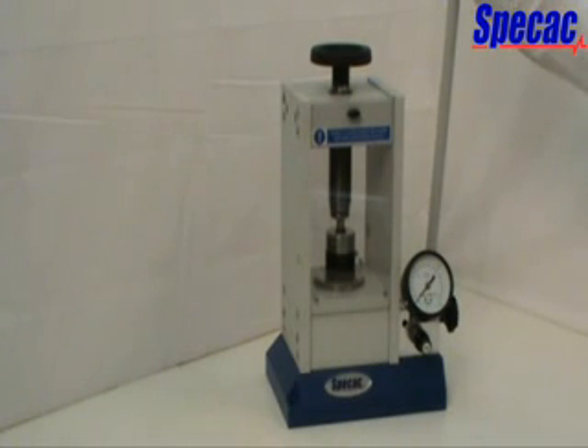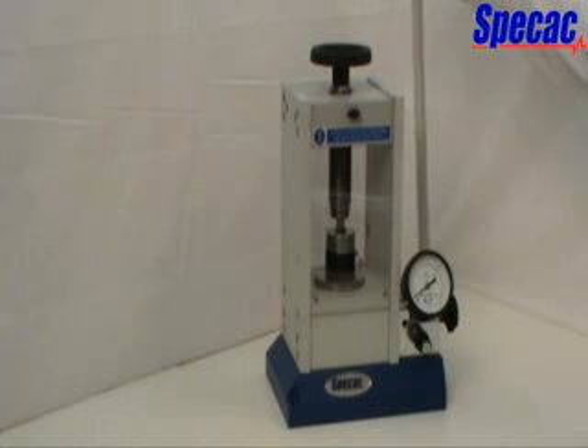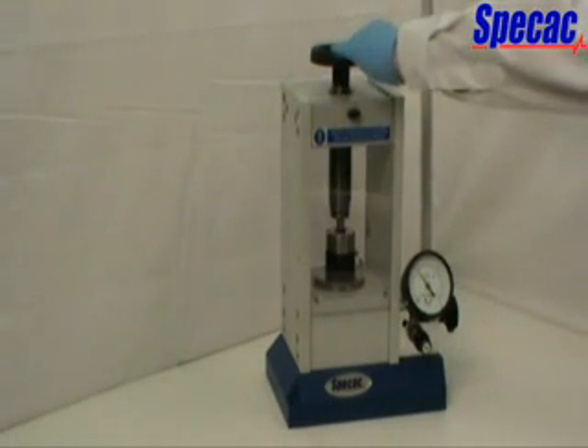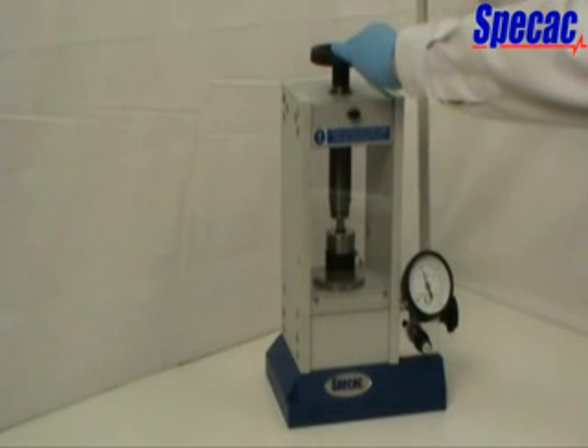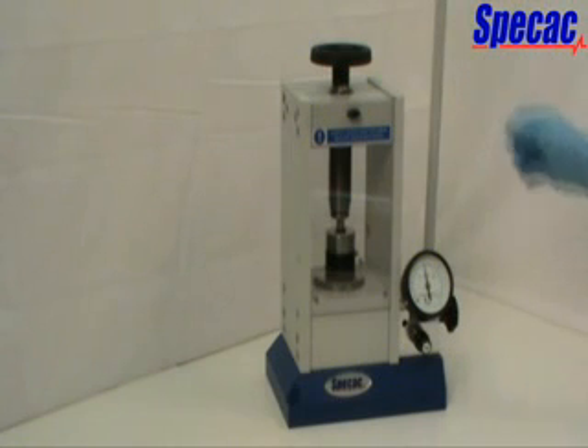Ensure the front and rear safety guards are lowered and start to pump the press by pulling and pushing gently but smoothly on the pump handle. The correct leverage and force is applied by holding at the rubber handle. It may take a few hand pumps to build up pressure in the oil, but once resistance is offered by the work to the raising of the piston, a tonnage load will be indicated on the load gauge. Keep on pumping until the required tonnage load is achieved.